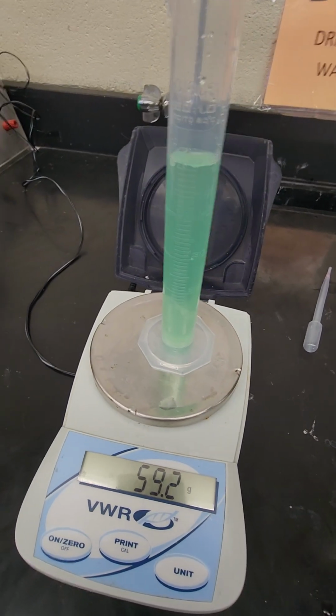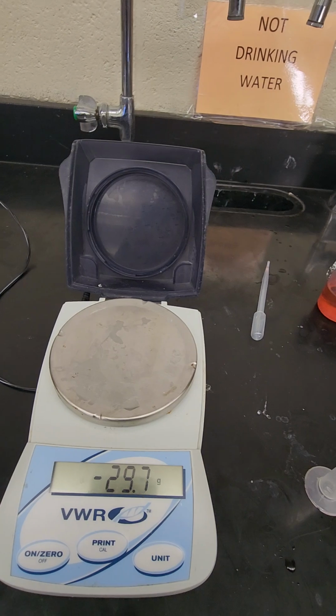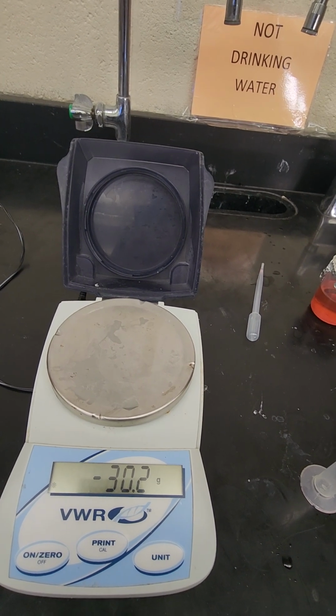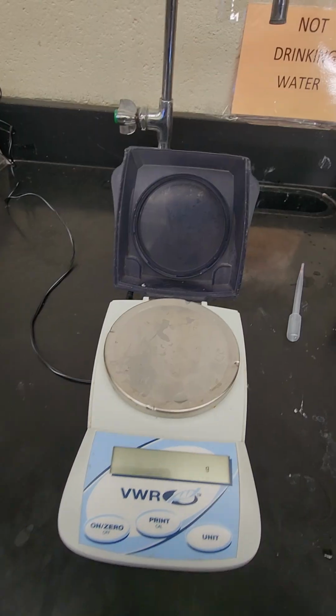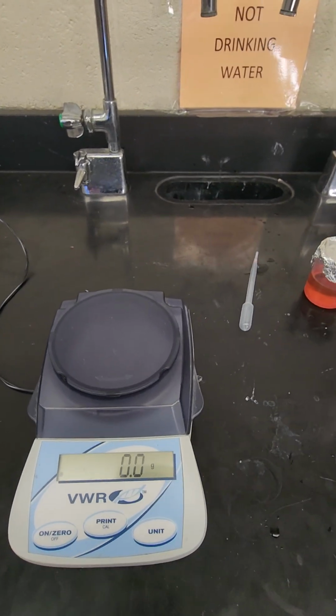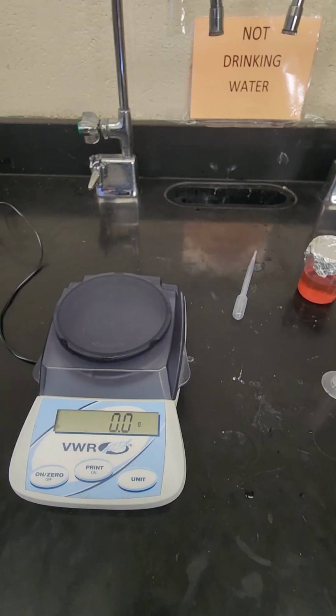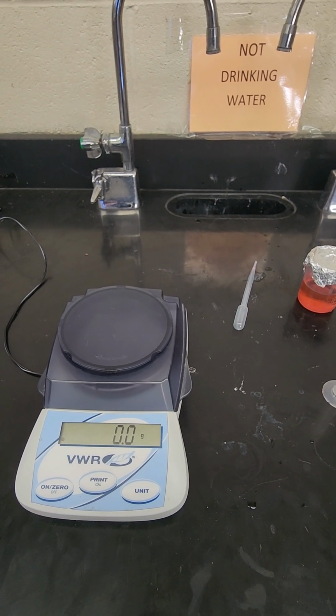So in your data table, you're going to want to write all this information down and then calculate the density of each one by doing mass divided by volume. And then make sure that you write the name of the liquids above each data table. If you're not sure, look back into the materials section of your lab.